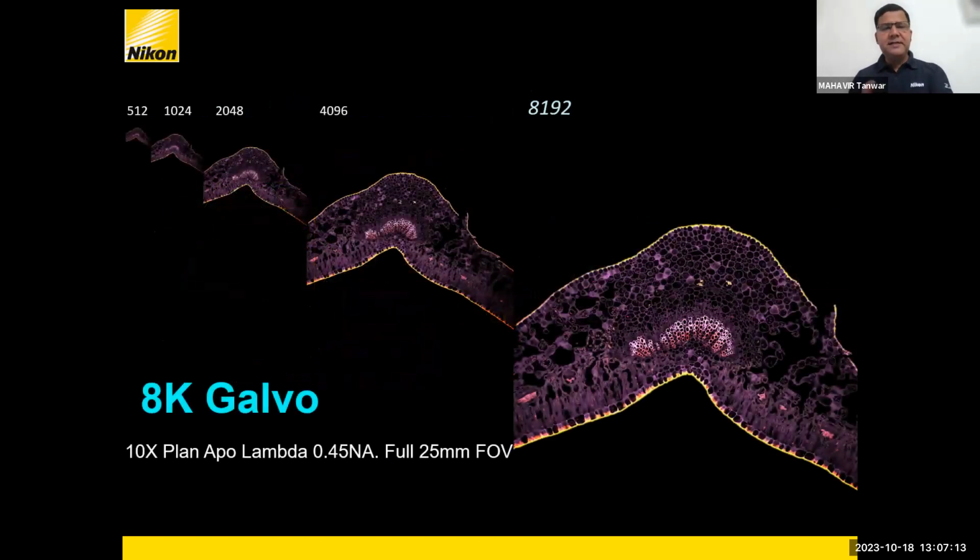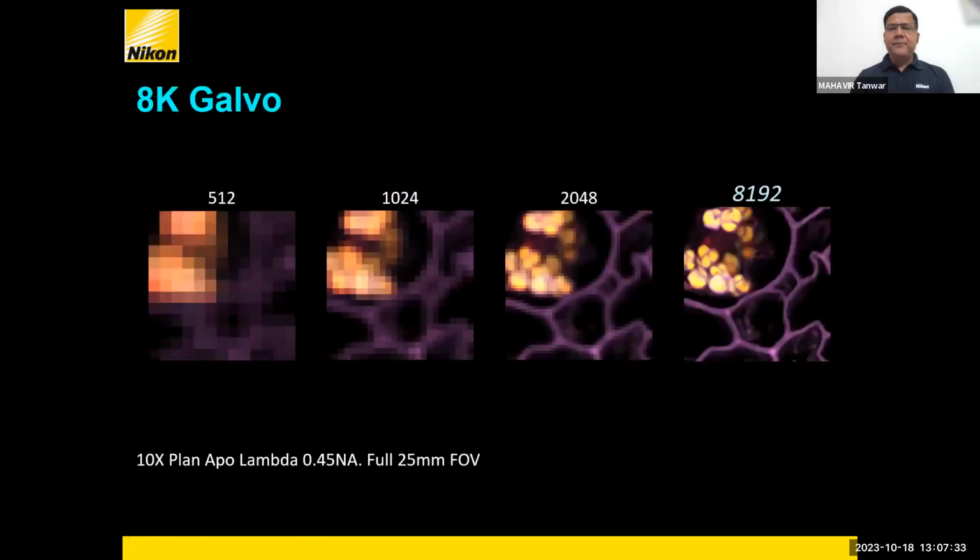So these are the different examples of resolution: 512, 1K, 2K, 4K, 8K. Let's say I want to zoom into this particular red region, on the extreme right. If I capture this whole image using 512 and want to zoom in, what will happen? Let's see.